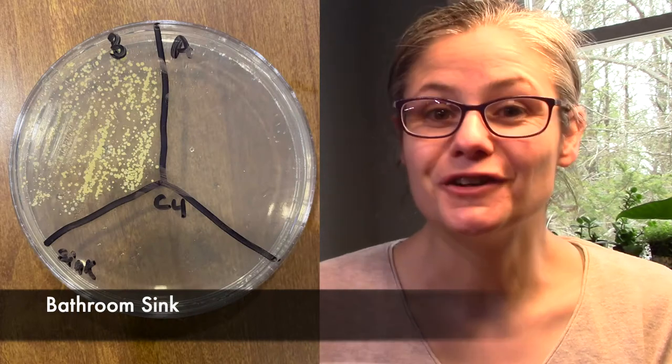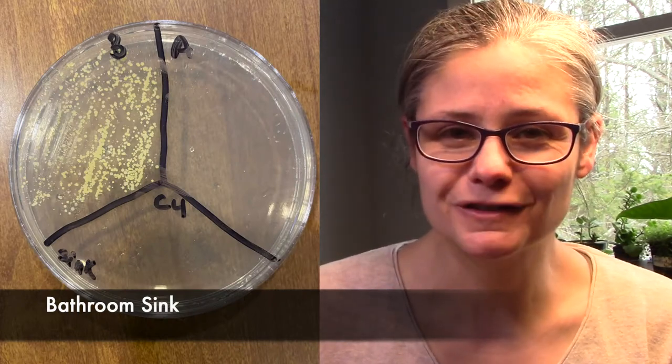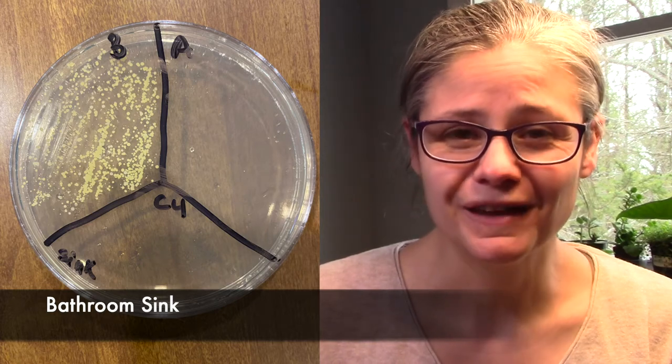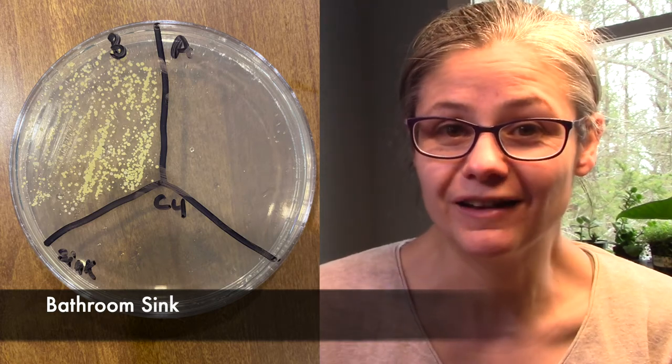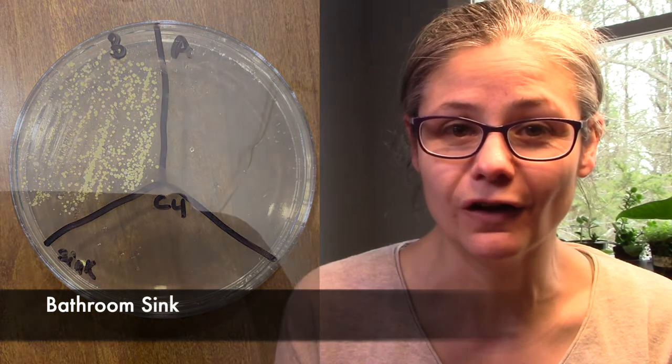The bathroom sink. We see in the before section there's a lot of bacteria there, not as much as in our toilet, which is a good thing. And in the after section, we have nothing — none at all. I couldn't find any bacterial colonies there at all. So Microband does a fantastic job at disinfecting my bathroom sink.